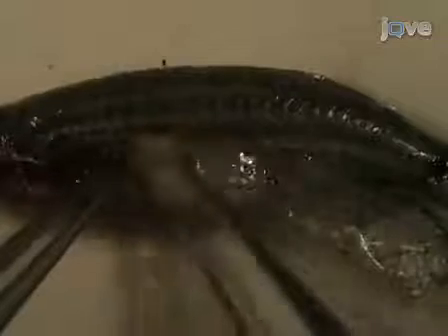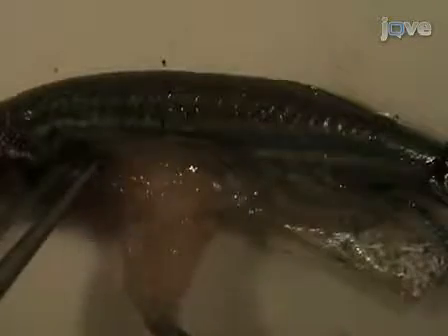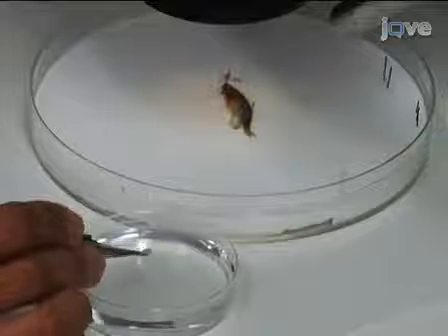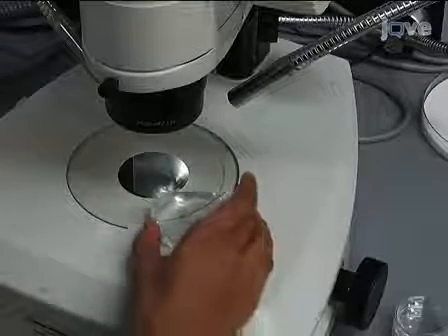The ovary is a bilobed structure that is suspended in the body cavity by a vascularized mesovarium. Remove one lobe of the ovary and place it in PBS. Examine the ovary with incident light under the microscope. The oocytes can be teased apart using fine needles and then assigned to stages given their size and appearance.